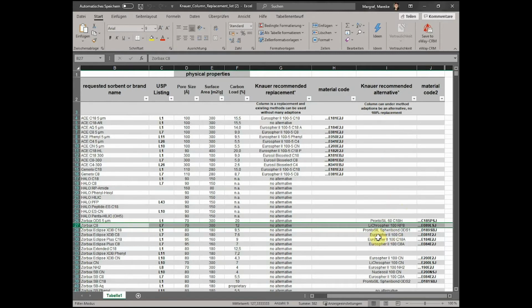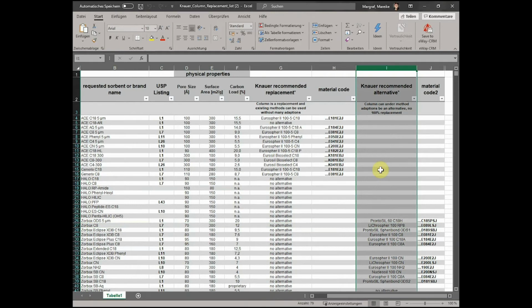We wrote here an alternative column. If you have a customer that is really satisfied with his column and just is not able to get it anymore or something, I would not recommend to use a column that is only listed here and not here.